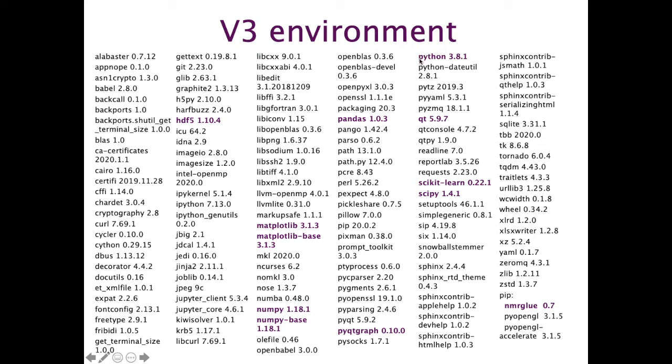So obviously we're working here in Python 3.8. We use Qt to do all the graphics, to do the pop-ups. We do our graphing primarily with PyQt Graph, but we've also included Matplotlib, which is popular with many people. We've got NumPy and also SciPy, which include a whole load of mathematical routines. NMR Glue includes things specific to NMR. Pandas data frames is something that we're finding increasingly useful when dealing with large data sets. So Luca has been using that a lot for some of the screening work that he's been doing.